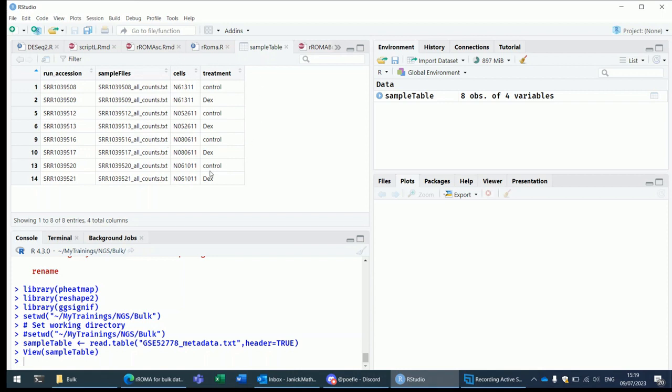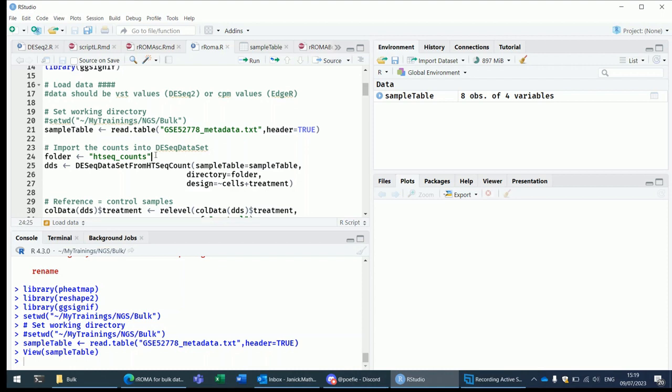And then additionally, you see here the grouping information of the samples. So the 09 sample, for instance, is a treated sample and comes from the cell line with this name. The grouping information divides the samples into different groups.